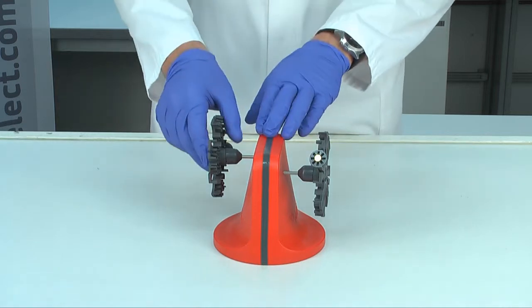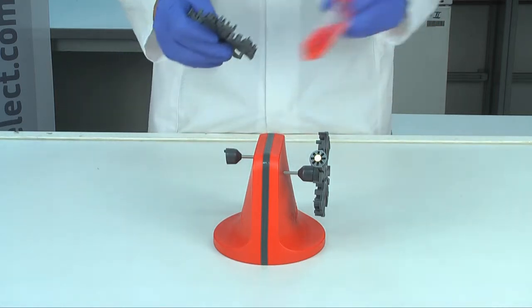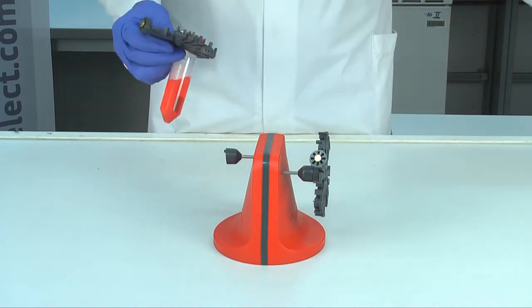Each holder can be loaded with a maximum of four tubes, either 50 milliliters or in combination of both.